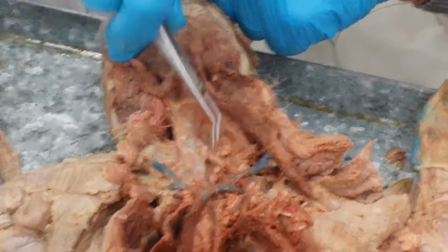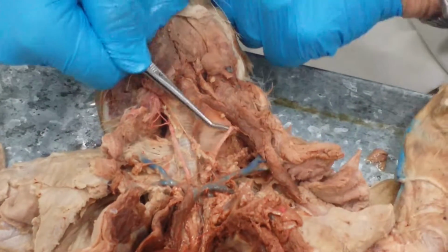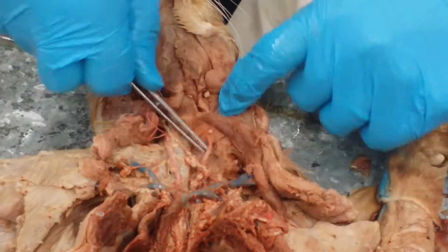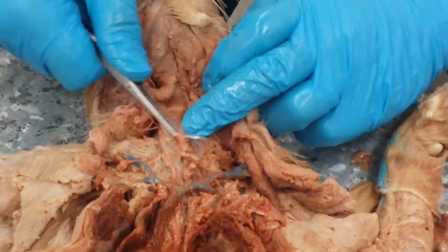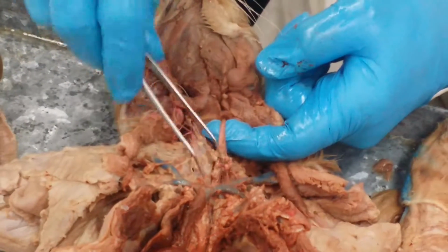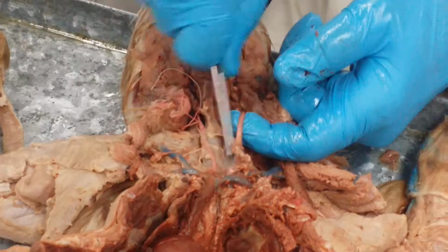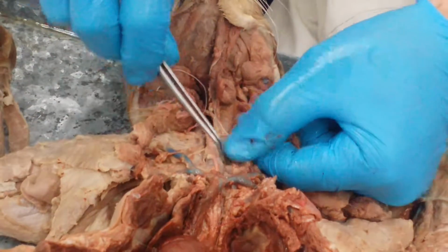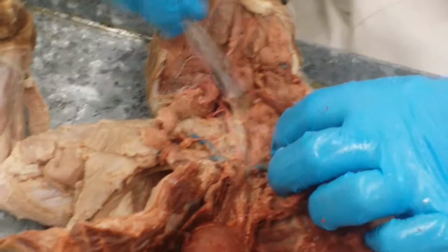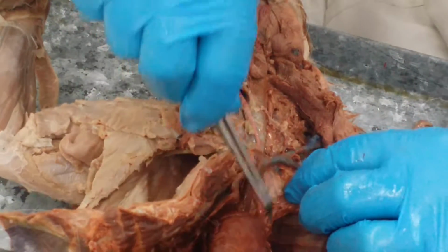That's not it. Is this it? Yeah, there it is. There's your left common carotid. And if you look, what's it from? That is the left common carotid. There it is.